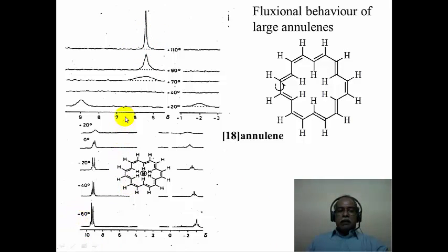In between, you can see there is a large uncertainty associated with the determination of the chemical shift value. Particularly if you look at plus 40 degrees Celsius, the uncertainty is so much that you don't see any signal also. You just see a flat line NMR for this particular compound. This is an interesting scenario, that you measure an NMR spectrum and you don't see a signal in spite of the fact there is a sample that is present, because the uncertainty principle essentially wipes out the signal to a flat line in this particular case.